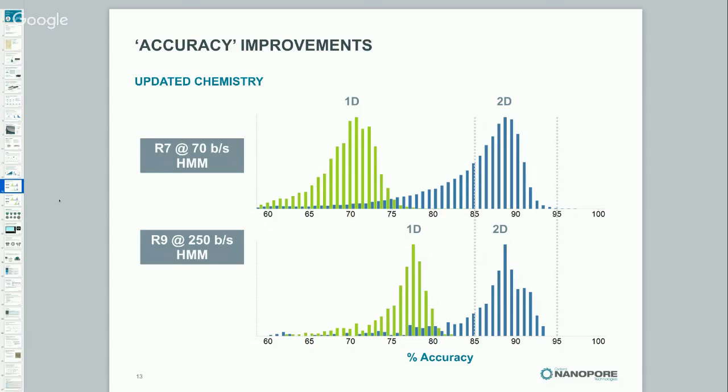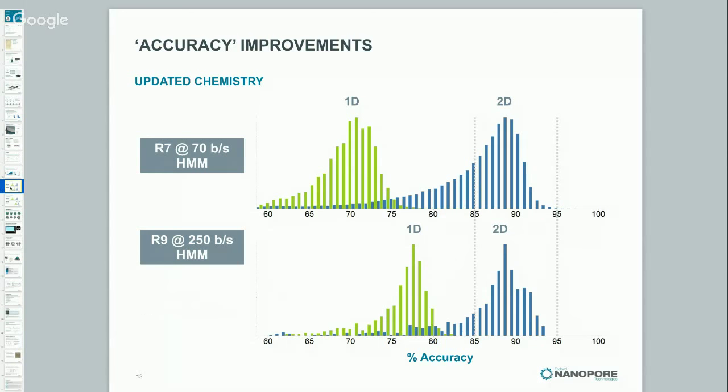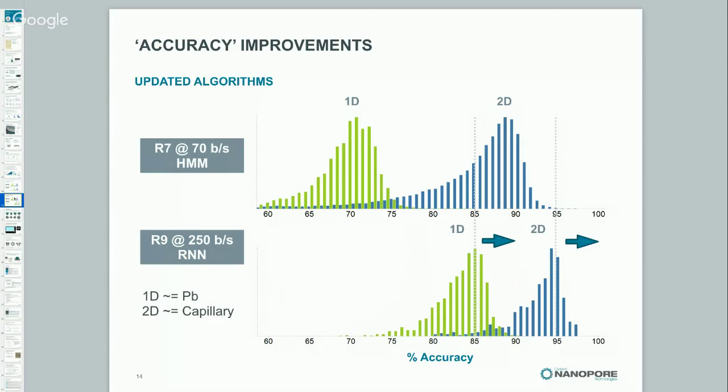However, we have been, thankfully, looking at some alternatives, having done an exhaustive study of what's causing error. We've been looking at some different kinds of base calls. So just to go back to that slide, there are some improvements here just from moving to R9. There are some chemistry improvements. But also we've improved the data quality quite considerably by using a different base call framework. In particular, we've been looking at using these recurrent neural networks that are quite popular with these deep learning advocates, in particular, a thing called LSTM.